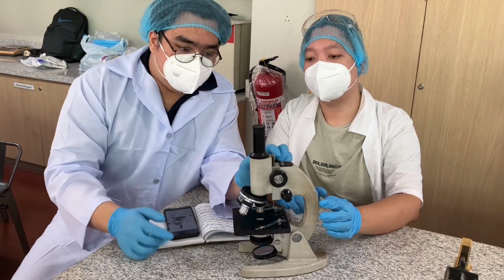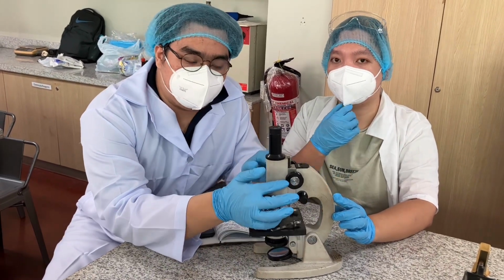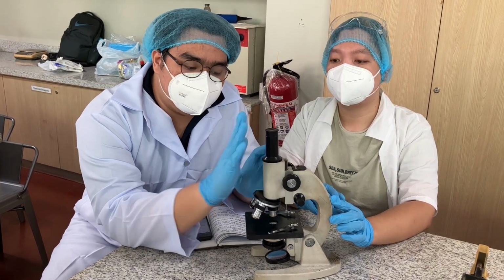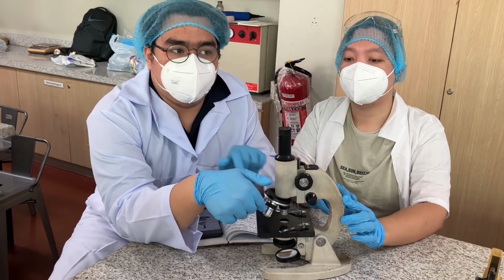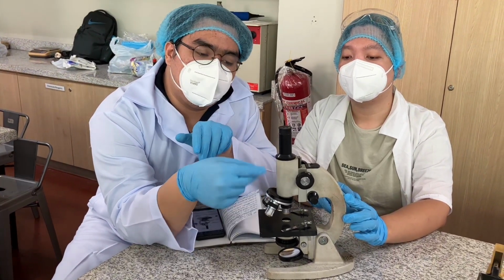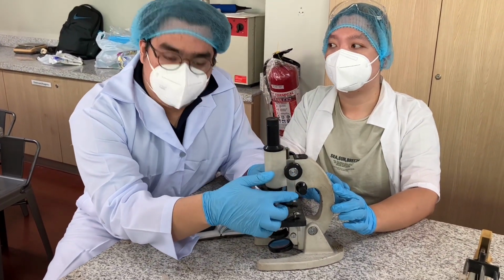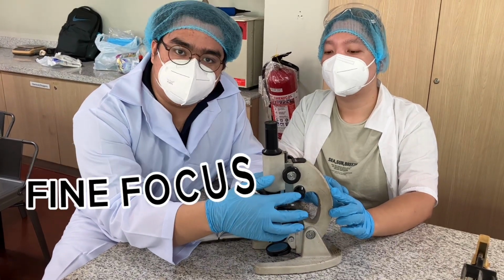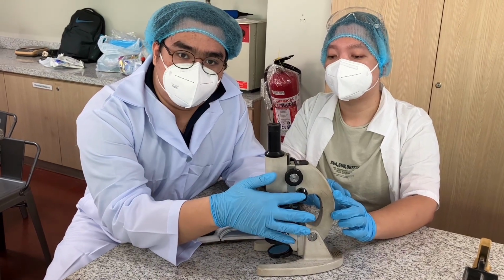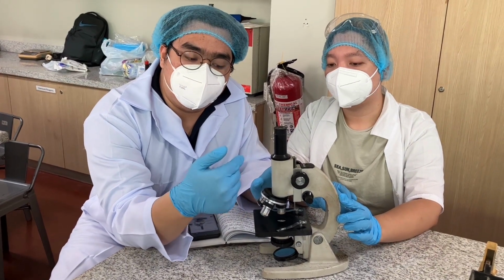Mainly, this thing. This is the coarse focus. The main function of this knob when you turn it is to adjust the distance between the lens and your specimen. So when you're looking for specific magnification of your specimen, this is one tool that you can use. Now, right here, this is the fine focus knob. And just as the name suggests, it adjusts the focus of your lens to observe your specimens right here.